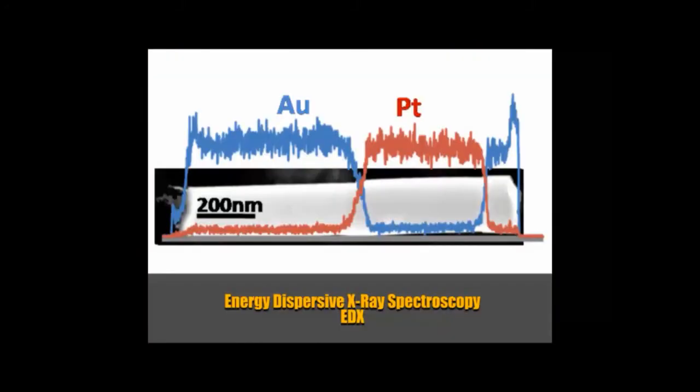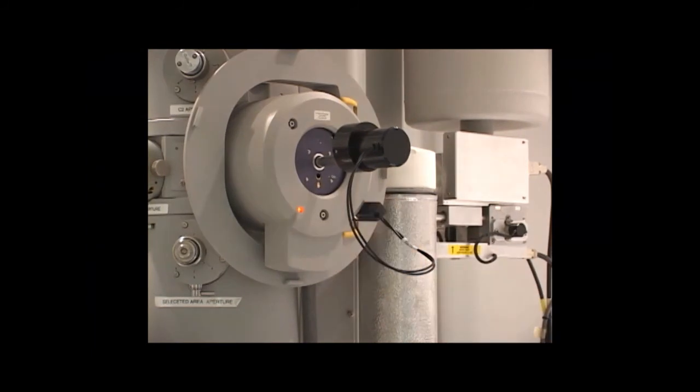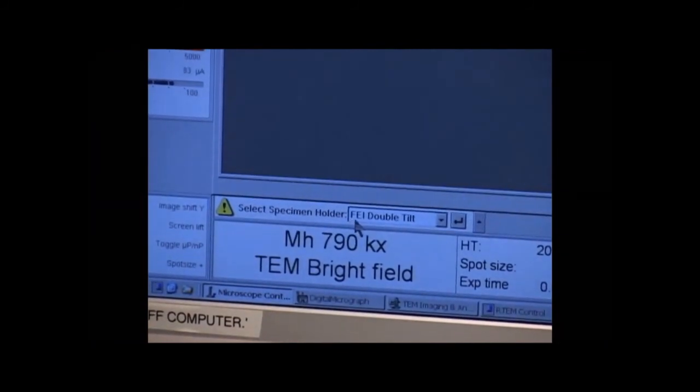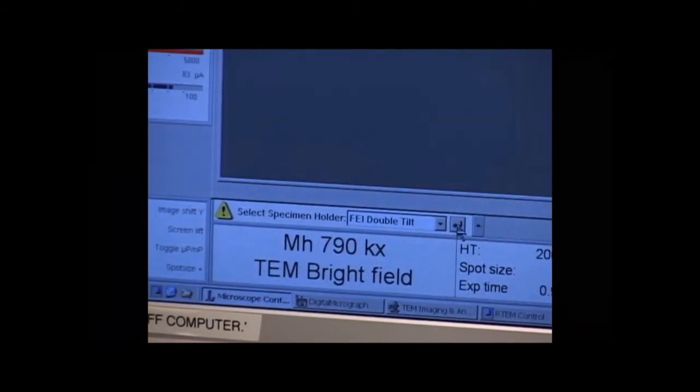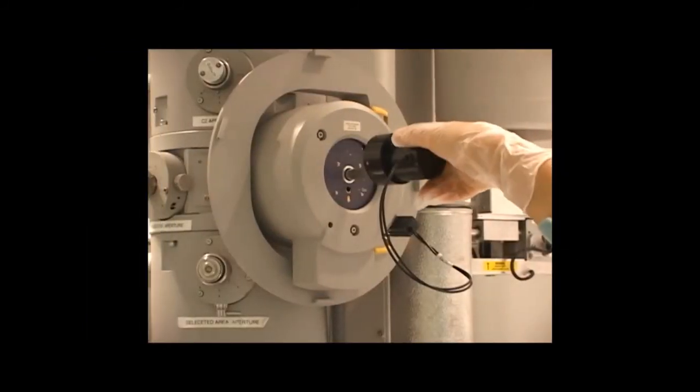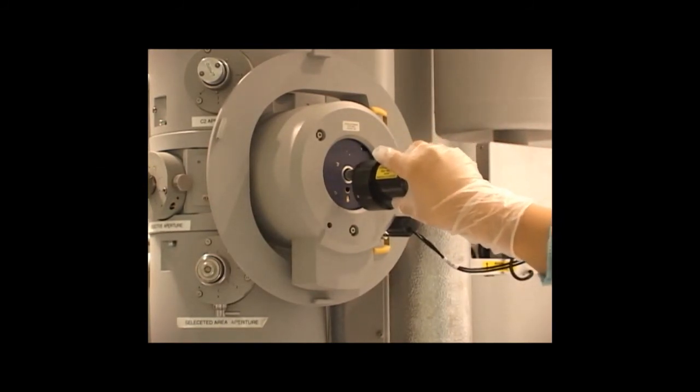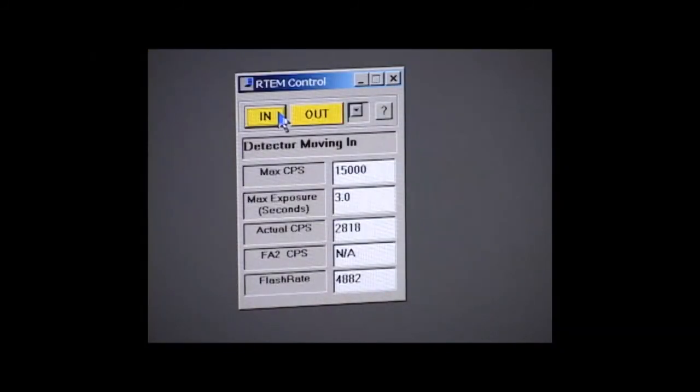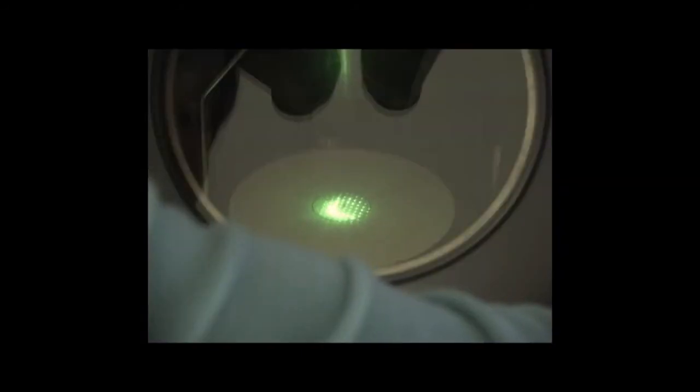This TEM is able to do Energy Dispersive X-ray Spectroscopy, or EDX. It measures energy of x-rays that bounce off the surface of the sample. For EDX, use the Low Background Double Tilt Holder. In the User Interface software, it asks you to select the specimen holder. Select FEI Double Tilt. It also asks you to connect the holder cable. With the system pumped down and the light off, turn the holder counterclockwise and let the vacuum gently pull the holder in. Click In, and the EDX detector moves in. This sample contains film layers of silicon and germanium alloys.